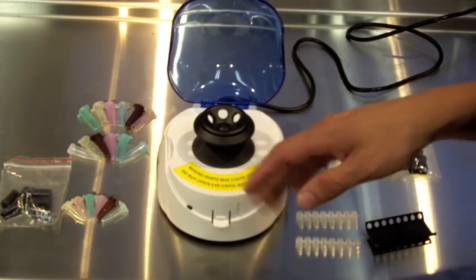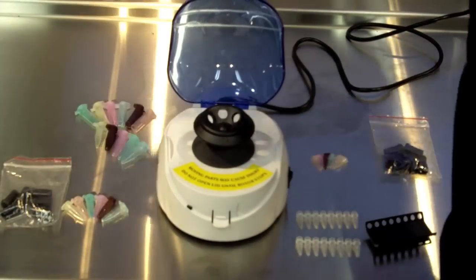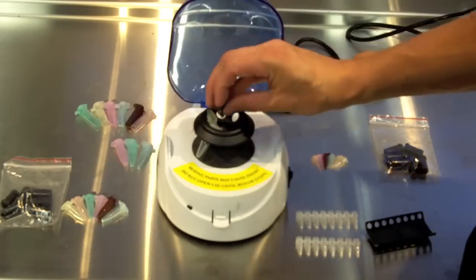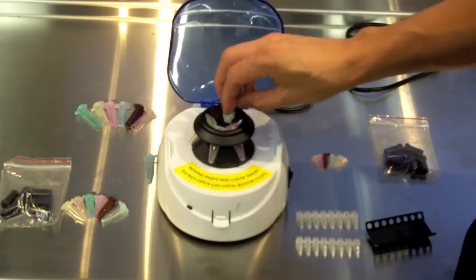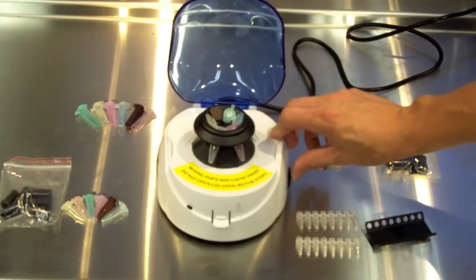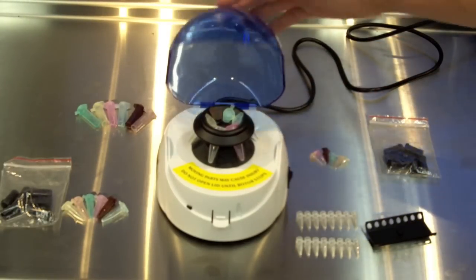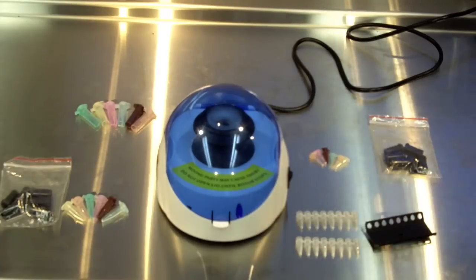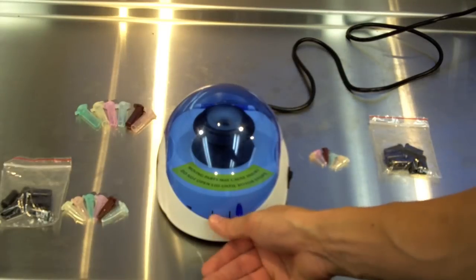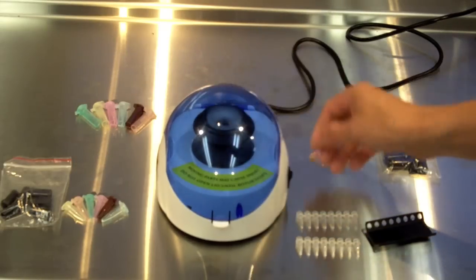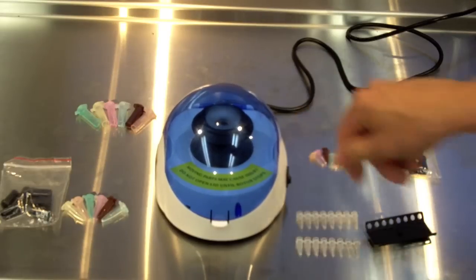Operation of the centrifuge is very easy. You simply load up your samples. There is an on-off switch on the side of the unit, as well as a switch on the lid. So, when you open the lid, the centrifuge will stop. Or you can use the power button on the side.